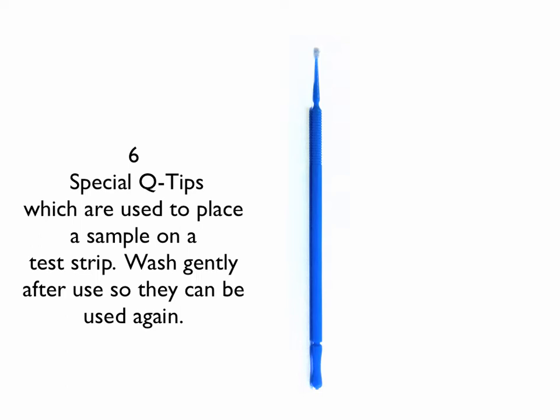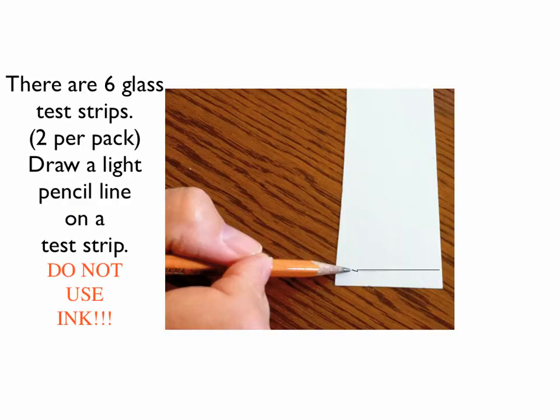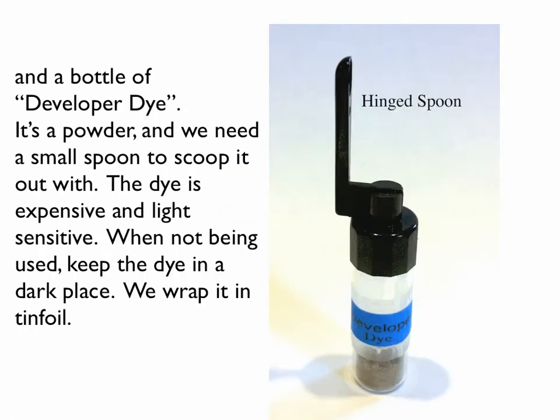They can be washed and reused, and a white sample spoon. There are 6 special test strips packaged 2 to a pack. A bottle of developer dye powder with a hinged measuring spoon. Mix 1 spoonful of dye with water in the spray bottle.